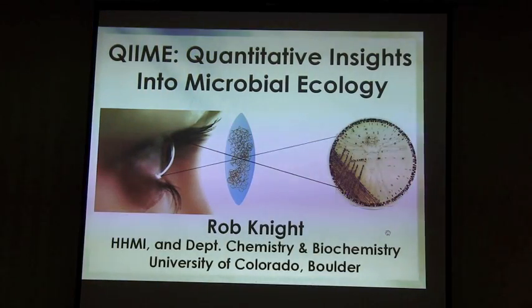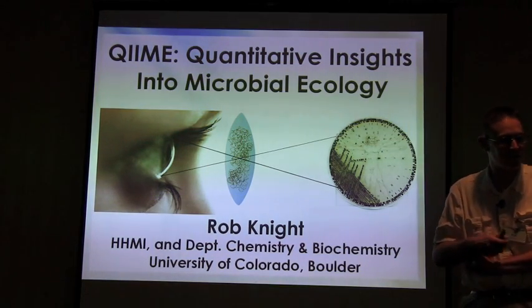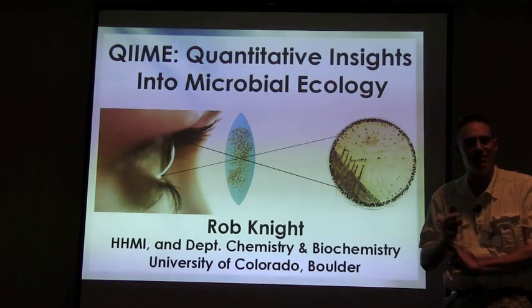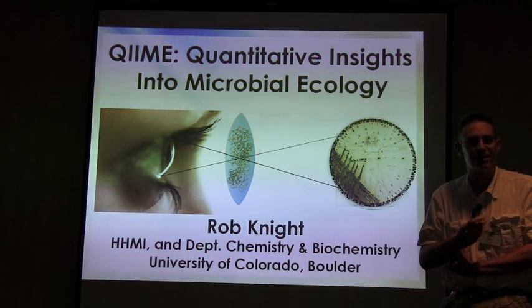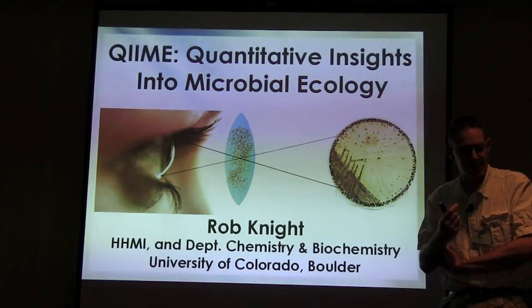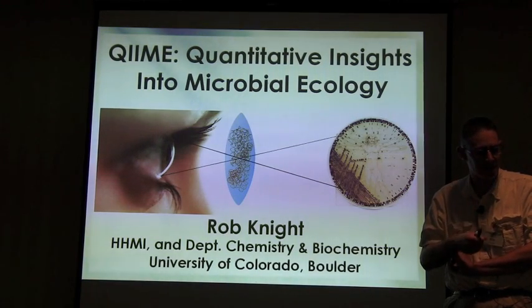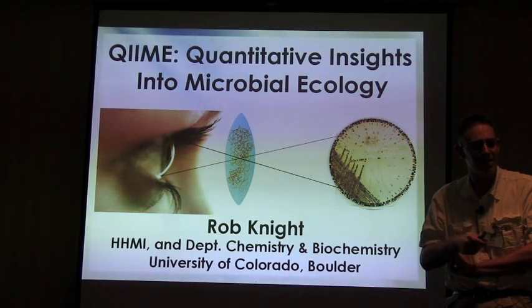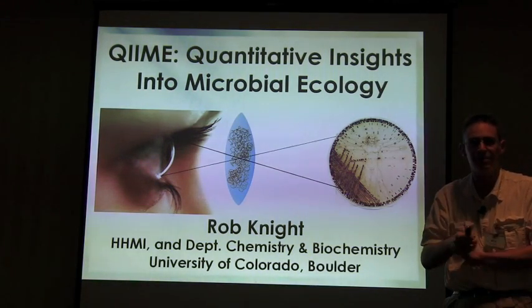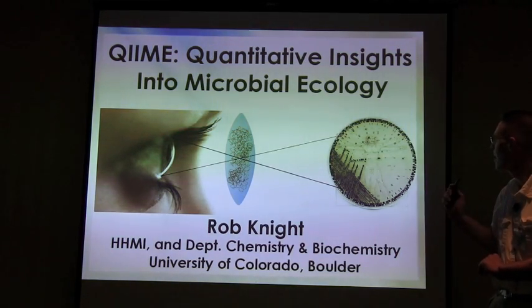So what I'm going to tell you about is some of the things we're doing with QIIME, which is this package that stands for Quantitative Insights into Microbial Ecology. A lot of the emphasis on QIIME is how do you get from your sequence data to a visualization that you can actually use. This project was initiated in my lab by Greg Caporaso, who's here, Justin Kuczynski, who's now at Second Genome, and Jesse Stombaugh, who are now at Thermo Fisher, and a bunch of people in my lab and collaborators around the country and around the world contributing to this open source effort.